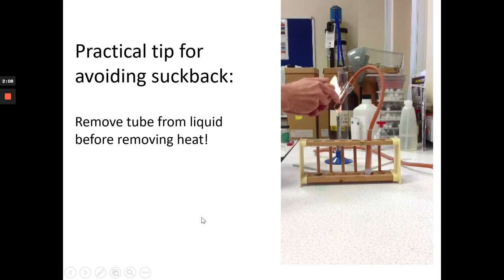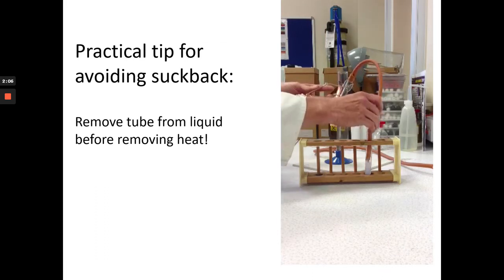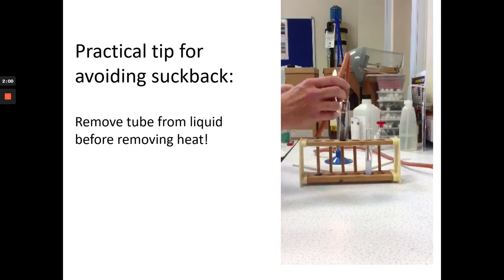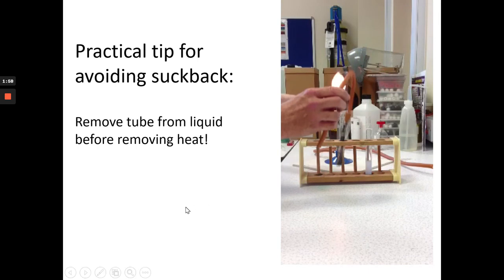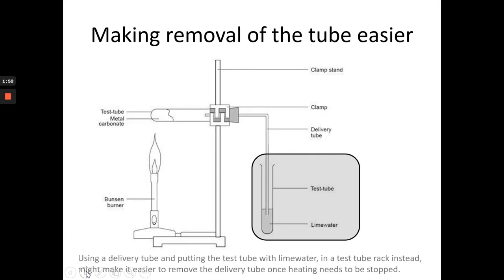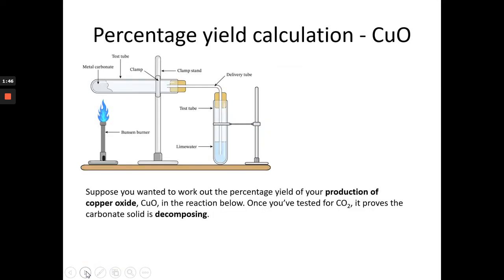It's very important to avoid suckback, so remove the tube from the lime water very carefully before you remove the heat from the carbonate tube. Okay, so to make that easier, you may wish to look at the assembly that involves the lime water in the test tube, and don't cork it so you can take the test tube away easily, for example.